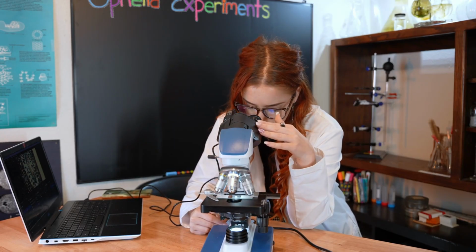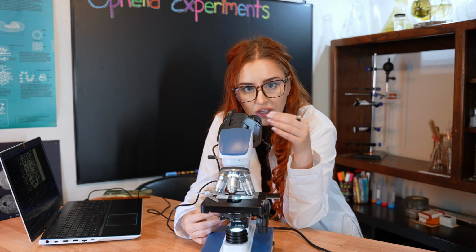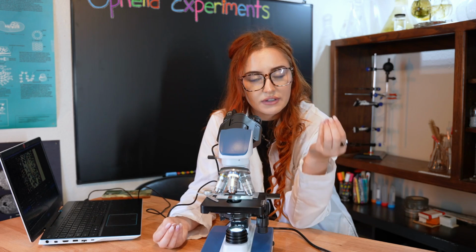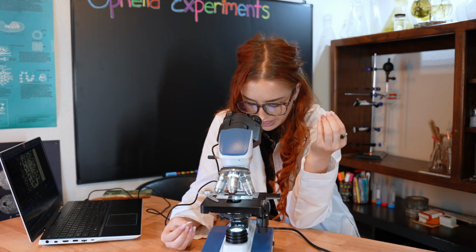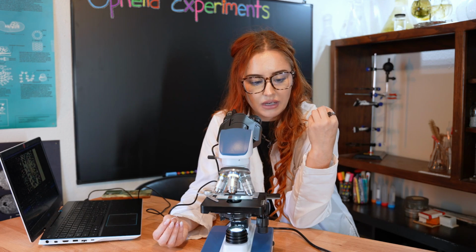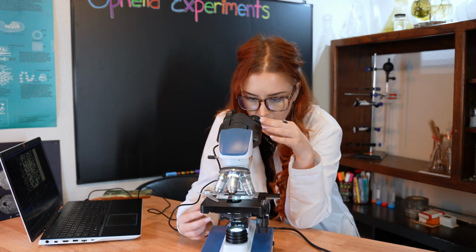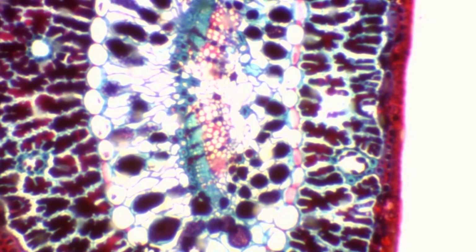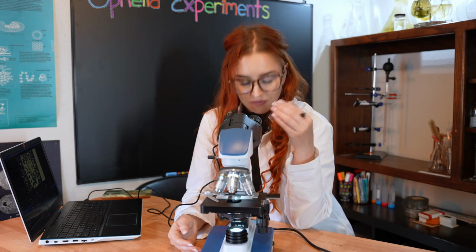It's really cool. So the first thing that we're going to look at today is the waxy cuticle. This is basically the surface of the needle that is covered in this waxy layer, and sometimes it appears smooth or more granular. So let's see if we can get that into focus. This waxy cuticle is crucial for reducing water loss. Yeah, there we go. And this basically helps the tree remain for survival in dry or cold conditions.